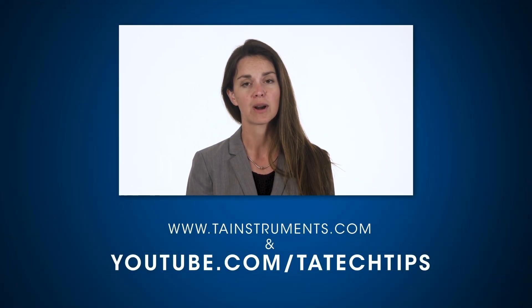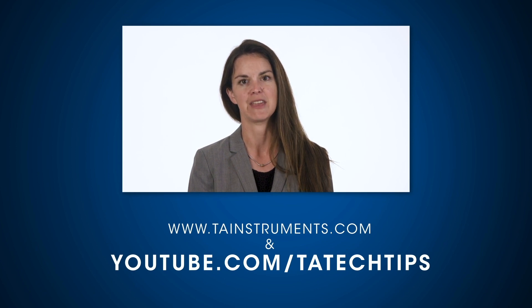In this TA Tech Tip, we learned how to manually load the injection syringe for an Affinity ITC instrument. Please stay tuned for more helpful TA Tech Tips and thank you for your interest.